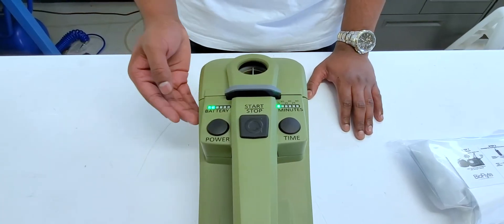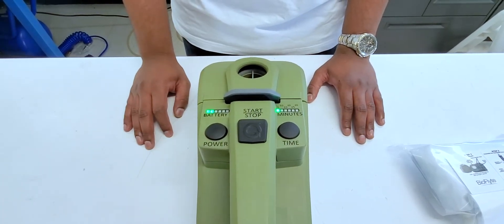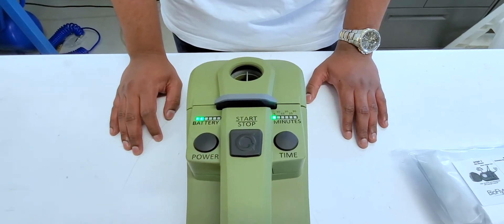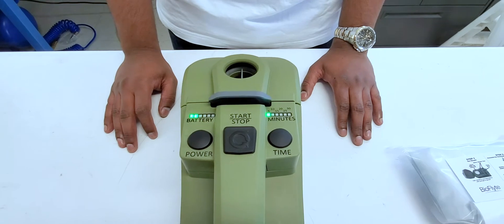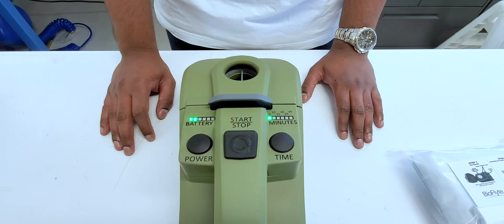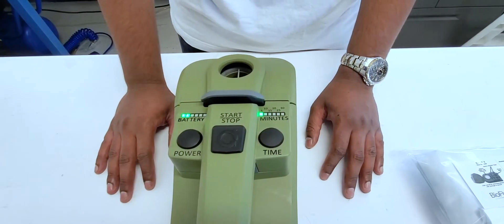As we see here, the left side of the machine indicates our battery level. The two LED lights out of the six indicate that we have just over a third of our battery left. When all six LED lights are lit, it shows the device is at full power, which means that we have over eight hours of battery.